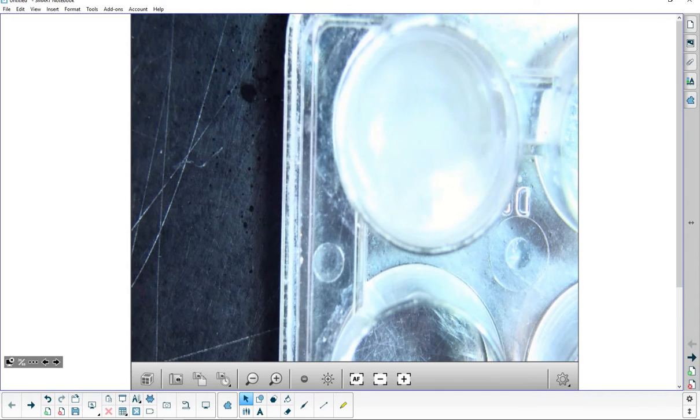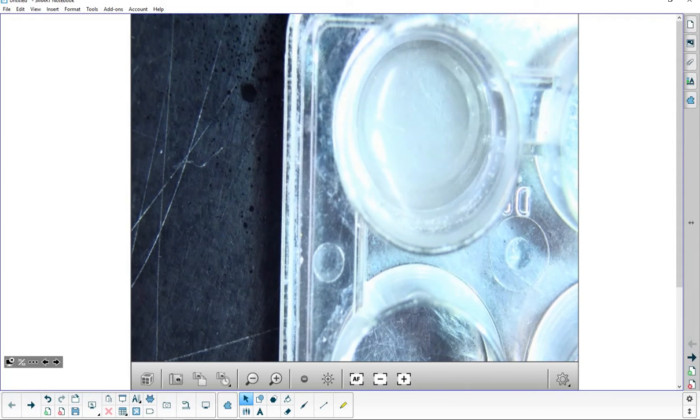This one you do need to be careful with too, because it gives off hydrogen gas, but some of that gas coming off is actually the hydrochloric acid that has been vaporized. So you don't want to be leaning over it and breathing it or getting it in your contacts. So just sort of stay back and watch it until it stops fizzling, and you're going to time it and be done. And this one can just be rinsed down the sink, because it works really well as a drain cleaner. Okay? All right.